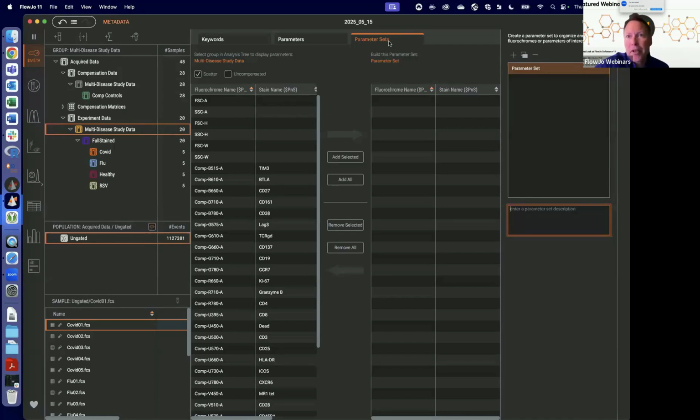The plugin for version 10 will, at the release of 11.0, have some extra functionality. We haven't built in the sortable image walls, for example, but it'll come. There'll be an 11.1 at some point after 11.0, and we'll just keep layering in functionality. But yeah, wanted to make sure we put it all in here.